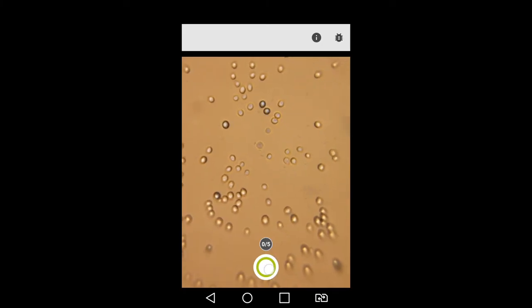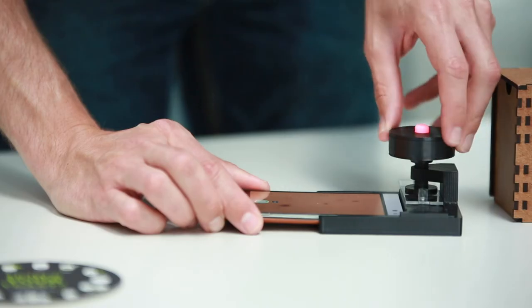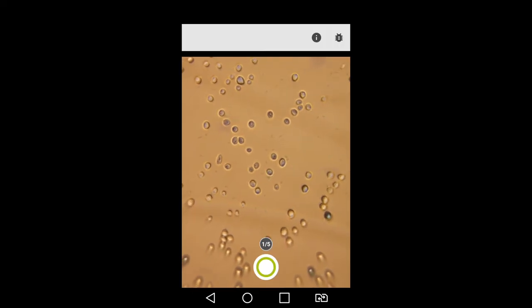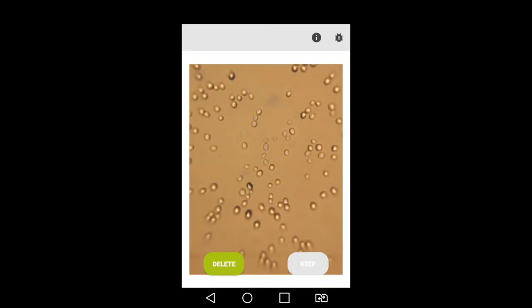Step 7. Take the picture. The app will automatically tell you if your images are in focus. Step 8. Click Keep. Step 9. You must conduct this step 5 times. Each time moving the position of the chamber to the respective markings.